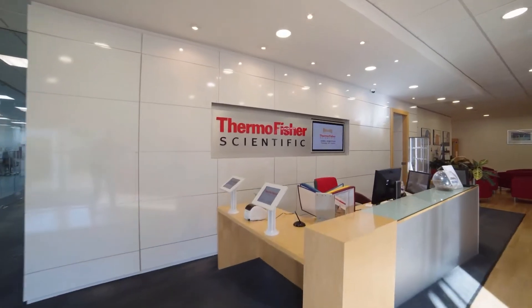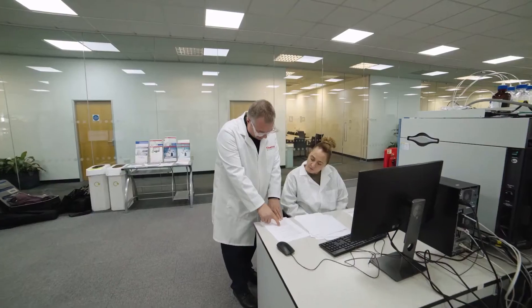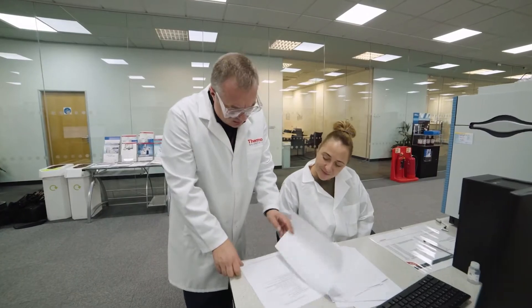As compliance standards shift and change shape over time, it's important for regulated industries to stay focused on requirements.